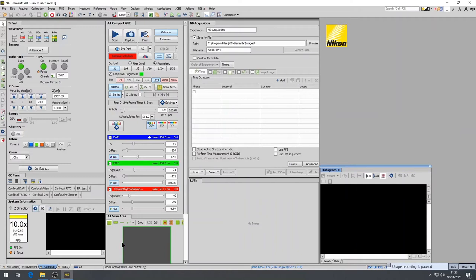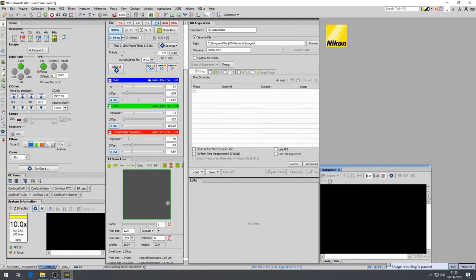And finally, the last window which is very important is the A1 plus scan area located below the A1 Compact GUI. And here you can control the size of your scan area and the step size of the galvanometer, also known as pixel size.